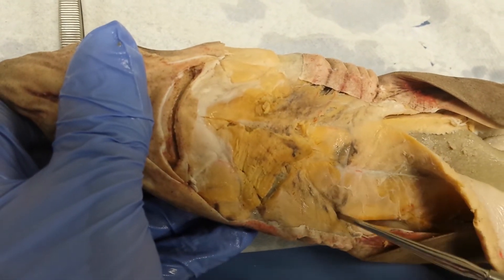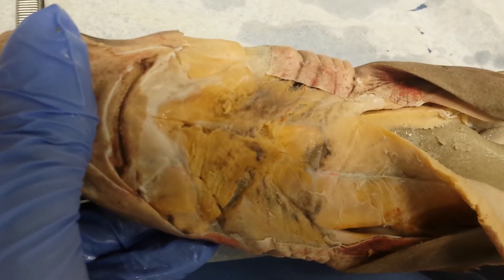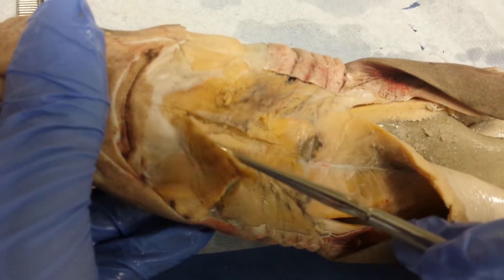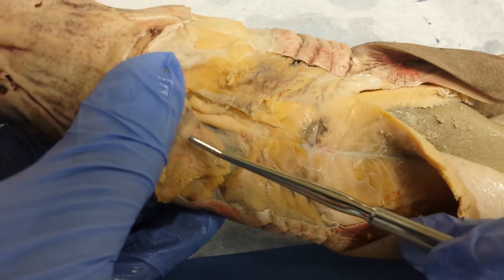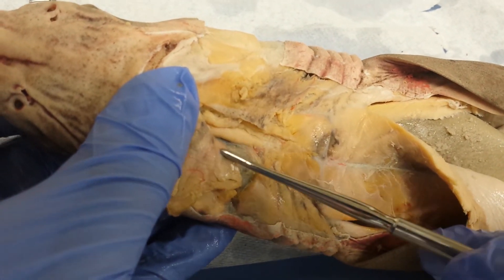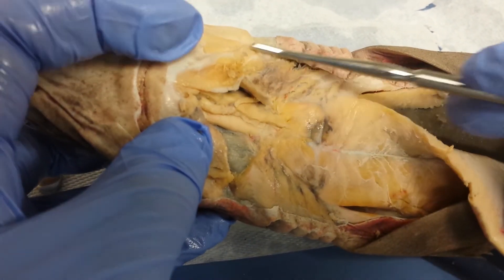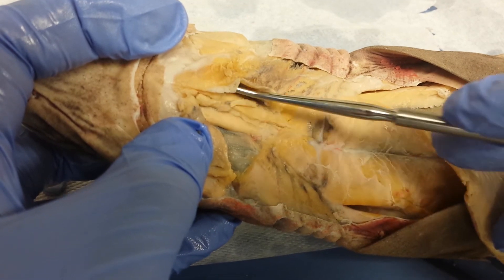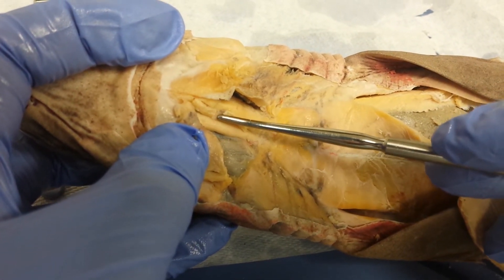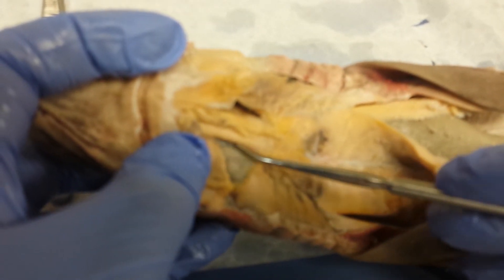At the bottom I have this area here that is called the coracoarcualis. You have to cut and reflect the intermandibular to re-expose the other ones. The back end of the intermandibular is known as the interhyoid. Here, cut and reflected on this side as well, I have a core muscle that is the coracomandibular. Part of it is cut, and then deep and lateral to the coracomandibular I have the coracohyoid.